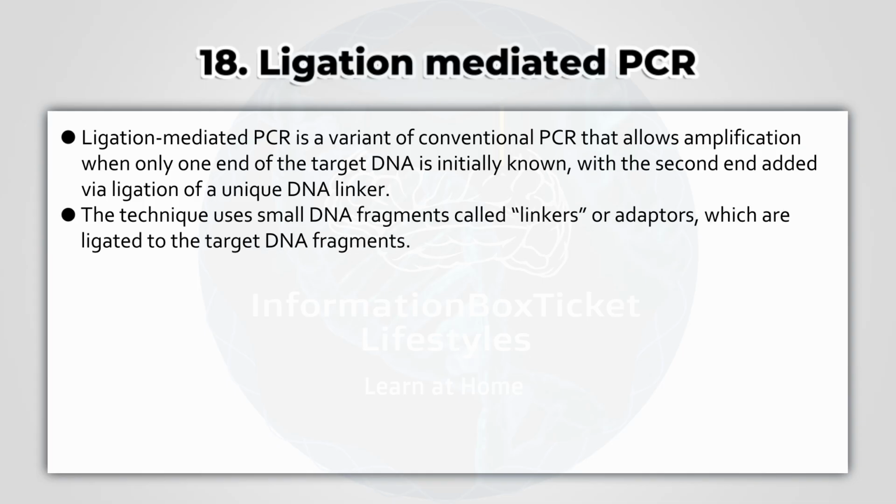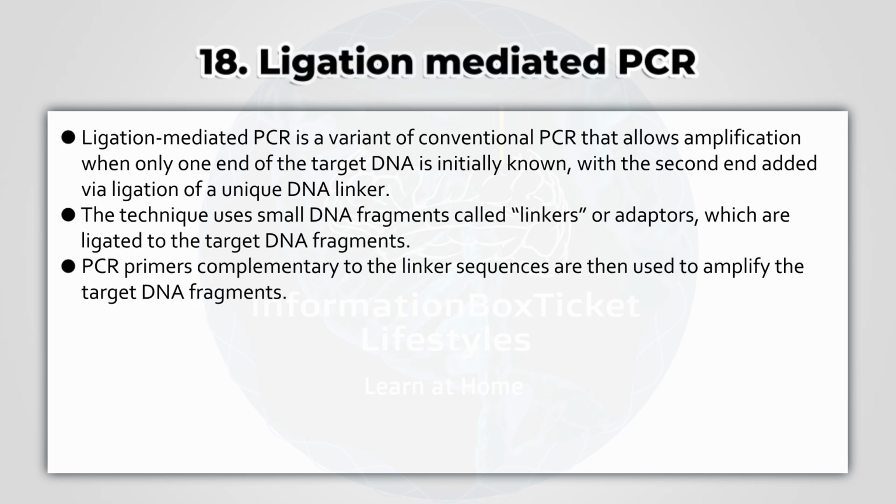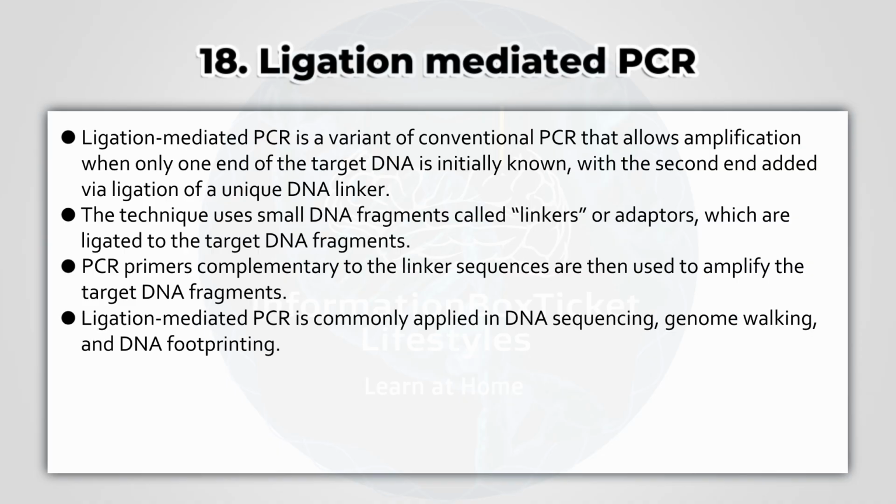The technique uses small DNA fragments called linkers or adapters, which are ligated to the target DNA fragments. PCR primers complementary to the linker sequences are then used to amplify the target DNA fragments. Ligation-mediated PCR is commonly applied in DNA sequencing, genome walking, and DNA footprinting.